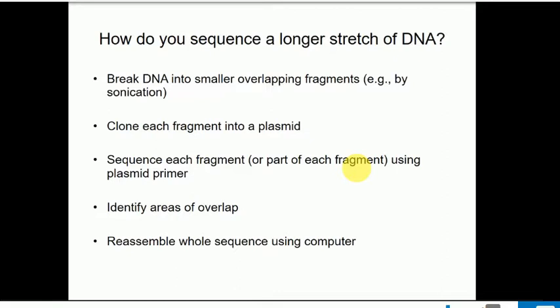How do the overlaps come about? Because if you've got random bits of sequence, by chance, bits of them will overlap with each other. I'll show you an example in just a second. One sequence and you've broken it up. But you've not just got one chromosome. If you make genomic DNA from a bacterium, you've got millions and millions of copies of that DNA, and you're breaking each of those randomly.